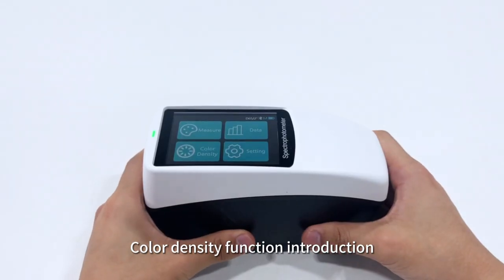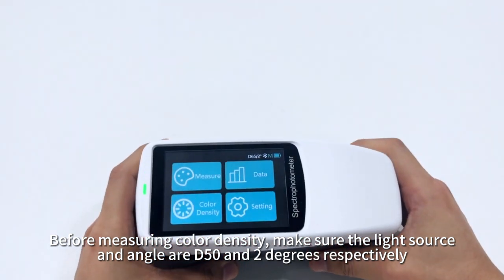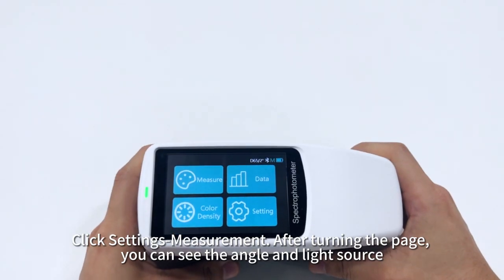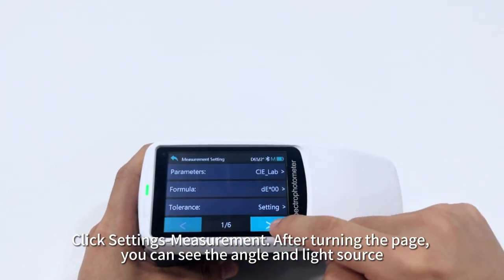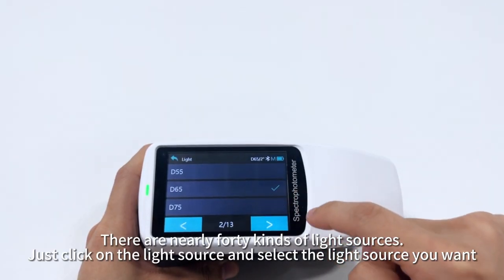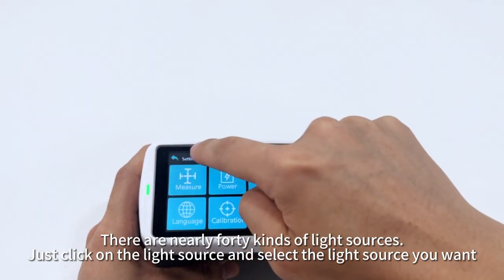Color density function. Color density function introduction. Before measuring color density, make sure the light source and angle are D50 and 2 degrees respectively. Click Settings, Measurement. After turning the page, you can see the angle and light source. Click to switch angles. There are nearly 40 kinds of light sources. Just click on the light source and select the light source you want.